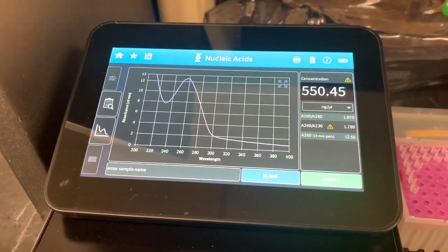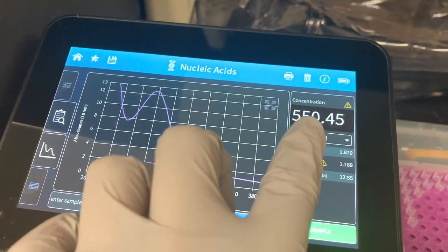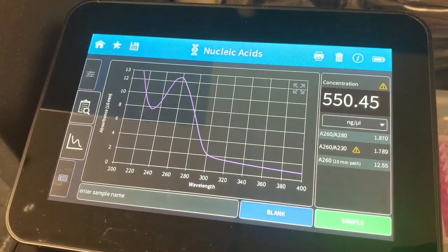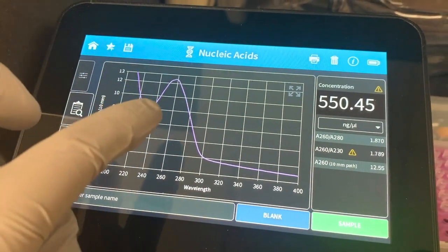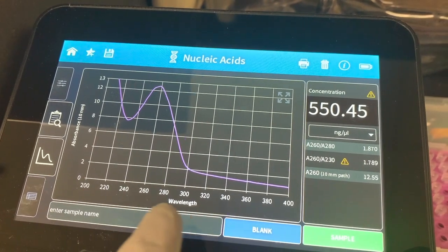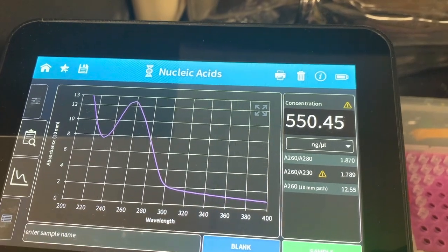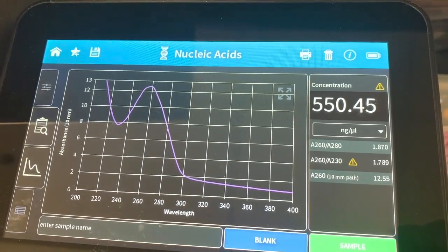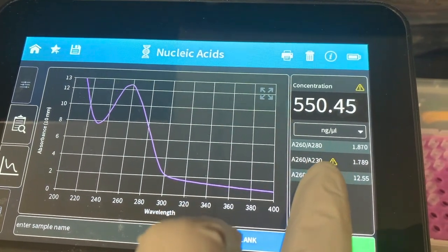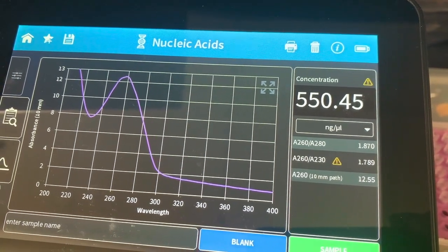And this will tell you a few things. First of all, this will tell you what the concentration is. So this is 550.45, so that would be 550 nanograms per microliter. This also gives you a curve with the absorbance on the y-axis and the wavelength of light on the x-axis. And so you can see one nice peak here, which is the absorbance of DNA right around 260. There are also two values here, 260 over 280 and 260 over 230. We actually like for both of these to be at or above 1.8.